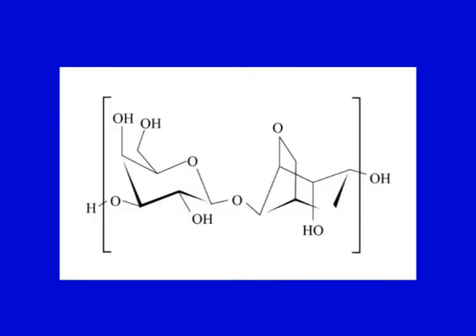Now, this is a simple schematic of the two units which agarose is made of, that is the repeating unit, agarobiose. Now, the gelling properties of the agarose are attributed to both intra and intermolecular hydrogen bonding within and between the long agarose chains. So, the whole matrix which is formed is due to the hydrogen bonding pattern actually.